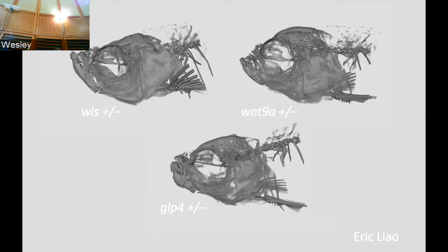It's used on sections already, as with the von Kossa staining. There's no reason why you can't get rid of it. What age was the embryo you tried? It was 16.5. And you could just remove the skin. Yeah, but the benefit is somehow you can age it if you don't need some kind of digestion. Okay.